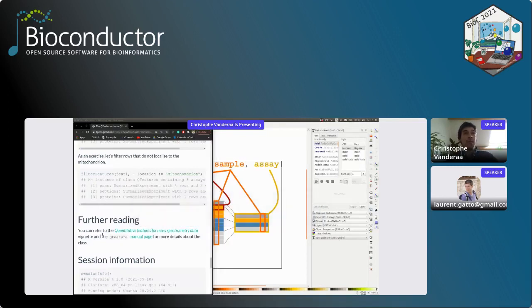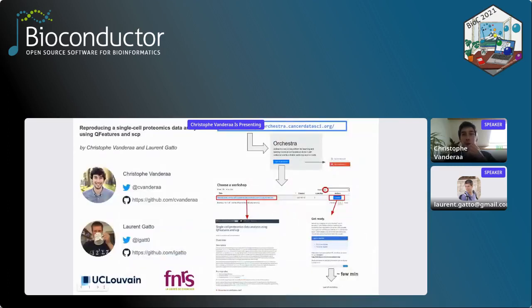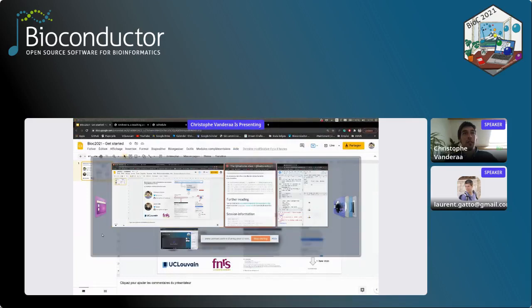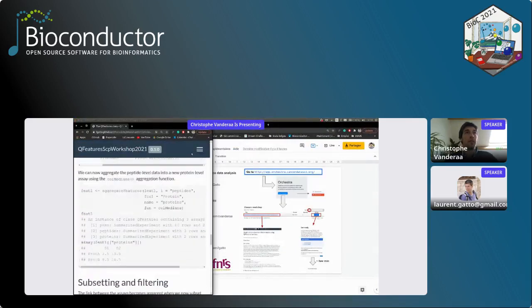Okay, maybe I'll show this screen a last time, because I hope now you are quite set up with RStudio. I'll give you maybe 5 seconds to memorize it because I won't show it again afterwards. And so now I'm moving to the second vignette.